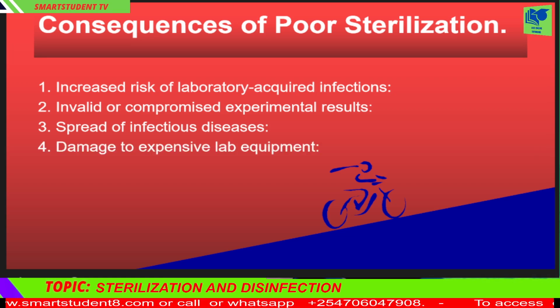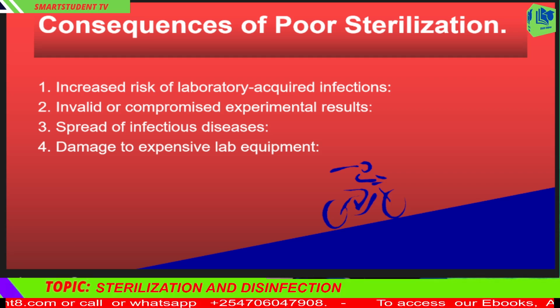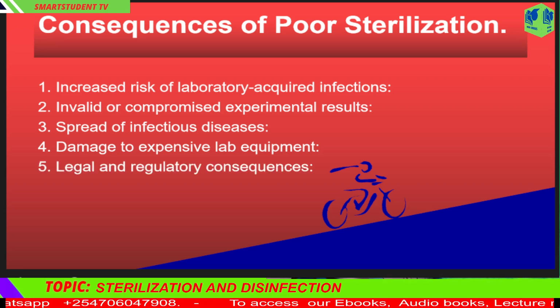4. Damage to expensive lab equipment. Residual contaminants can corrode or damage sensitive laboratory equipment, leading to costly repairs or replacements. 5. Legal and regulatory consequences. Failing to meet sterilization standards can result in legal penalties, fines, or even the closure of laboratory facilities.